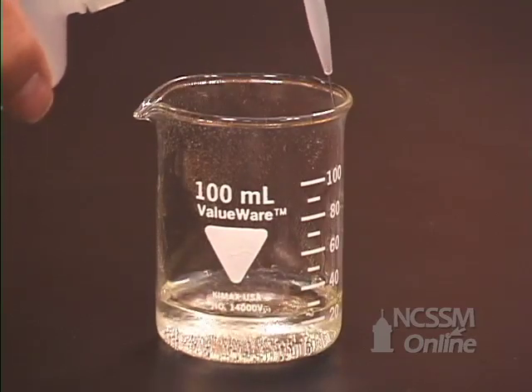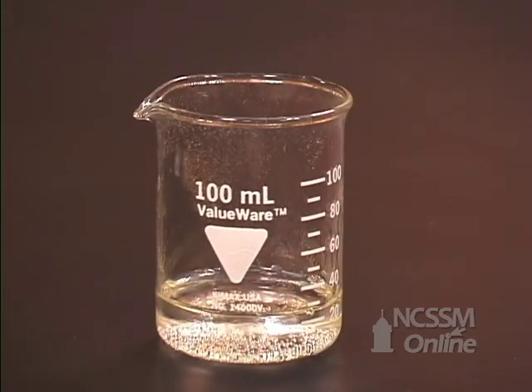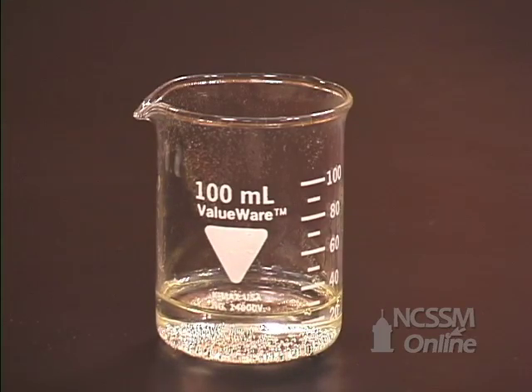You will evaporate the water to leave the sodium chloride. You will mass the beaker and the sodium chloride to determine the mass of the sodium chloride.